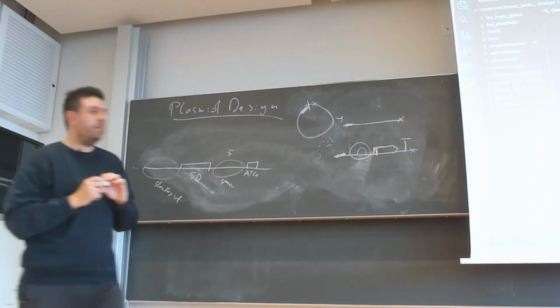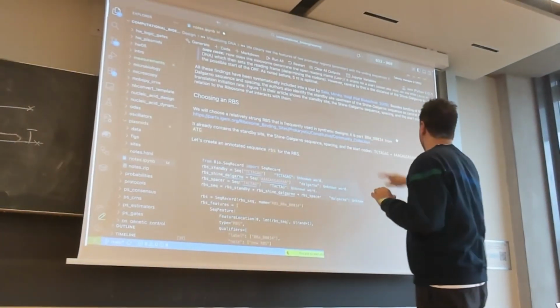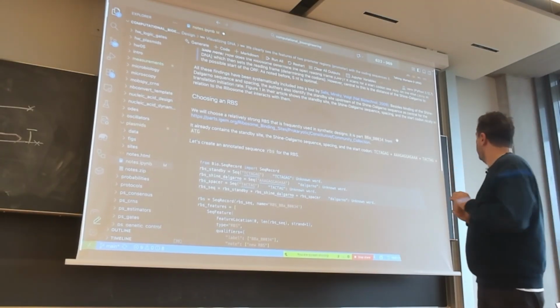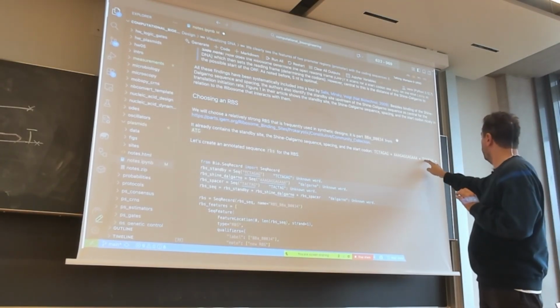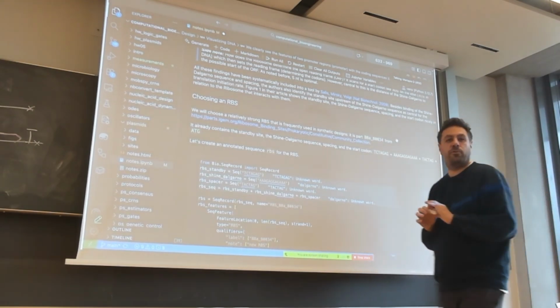But here we made it simple. We have just picked this one, and it already comes with these parts. So we are fine. If you look, for example, at the spacer here, there's 1, 2, 3, 4, 5, 6. Not optimum, but pretty close to optimum.